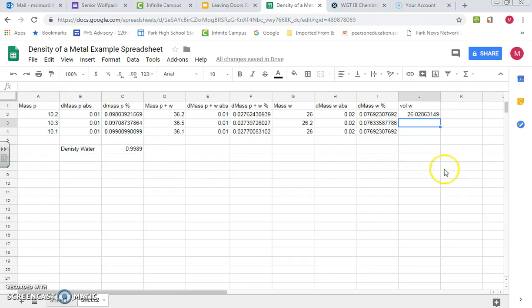But if you fill down here, you're going to run into a problem. So watch what happens when I fill down. I get this divide by 0 error. So I can go back and see, okay, this one is G2 divided, it highlights it for me when I click in here. It says it's G2, which I want, divided by the density, which is what I want. And I get the right number.